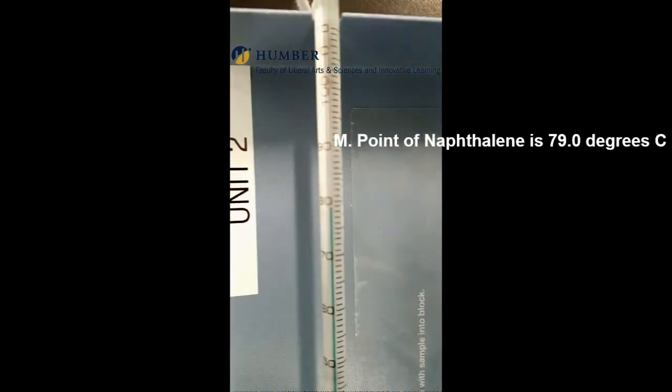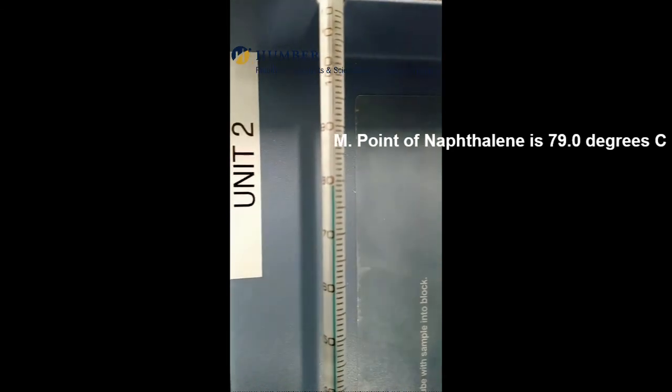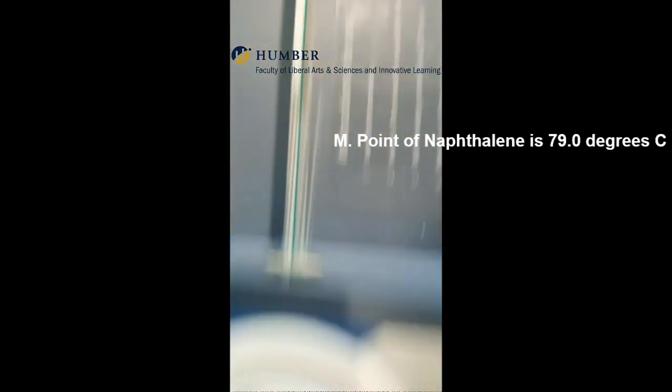Finally, observe and record the melting point for naphthalene. The melting point for naphthalene is seen to be 79 degrees centigrade.